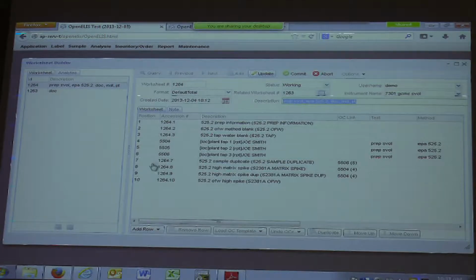And then the somewhat dangerous part is where after you've committed, you could go in and update these records, just like you could when you were creating it. But you want to bear in mind that if you do that, you're potentially changing the position number over here.